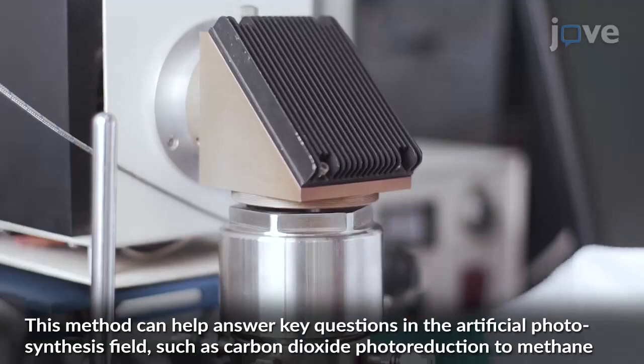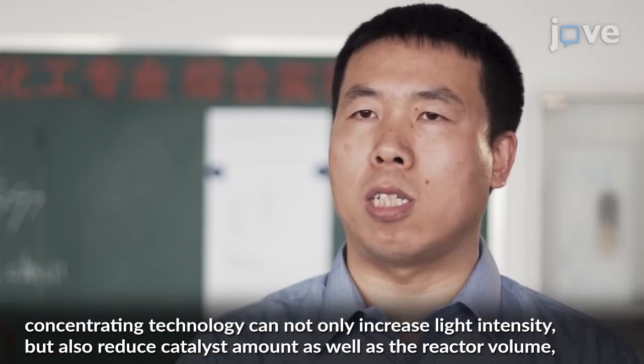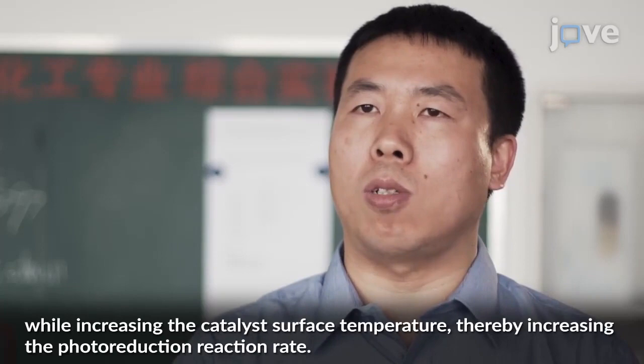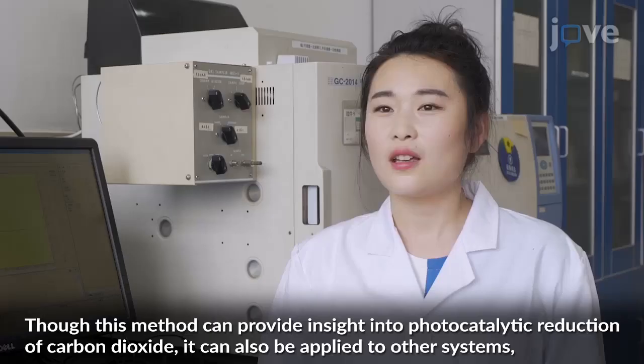Concentrating technology can not only increase the light intensity, but also reduce the catalyst amount as well as the reactor volume, while increasing the reaction temperature, thereby increasing the photoreduction reaction rate.